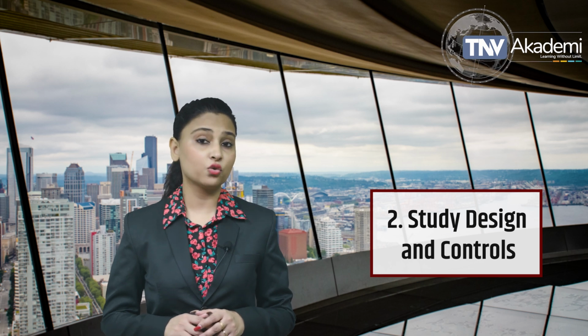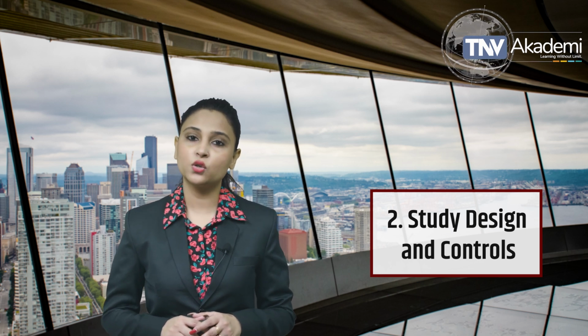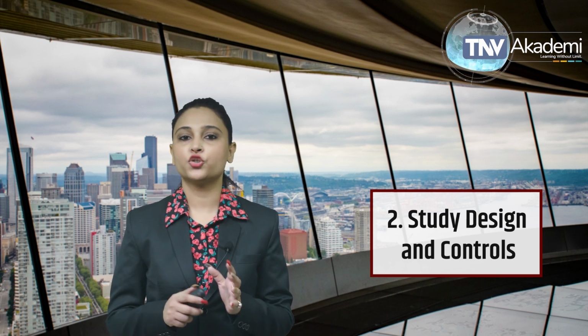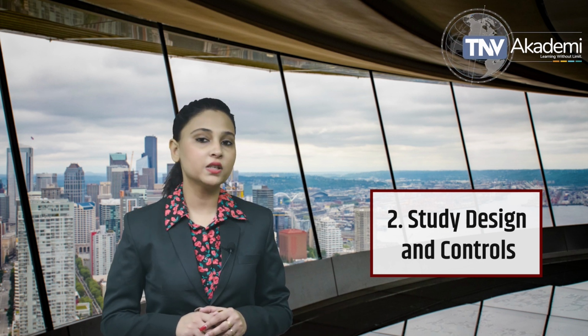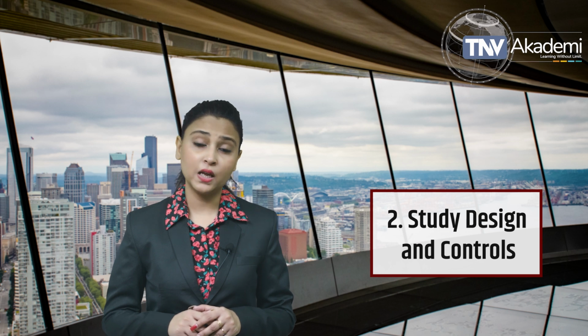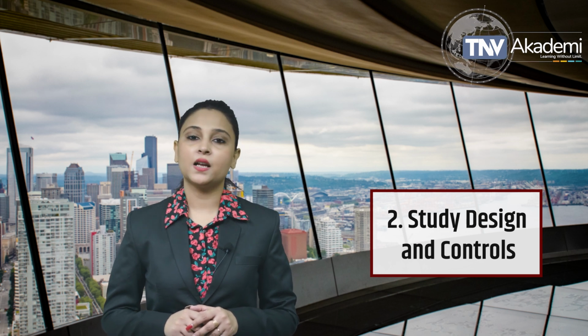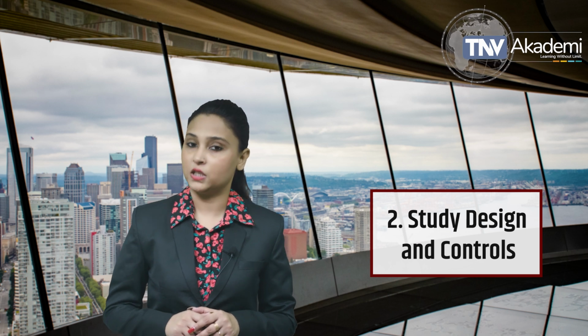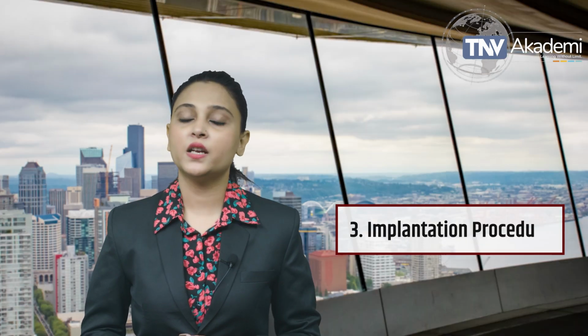ISO 10993-6 requires a controlled study design. This includes using both test samples and control materials to compare tissue responses. The control material is typically something known to be biocompatible, providing a baseline to evaluate any adverse reaction caused by the test materials.